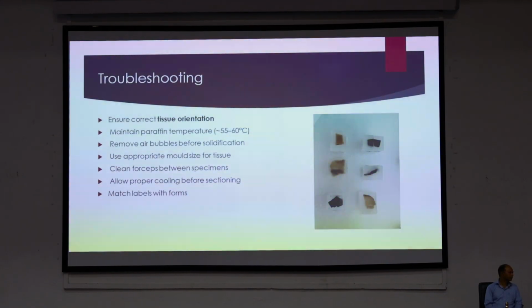For example, when a technician has completed embedding, at the last he must check and recheck how many cassettes have been put by the pathologist during grossing. Are they equal, are they less, are they exceeding what is mentioned on the form? This should be ensured.